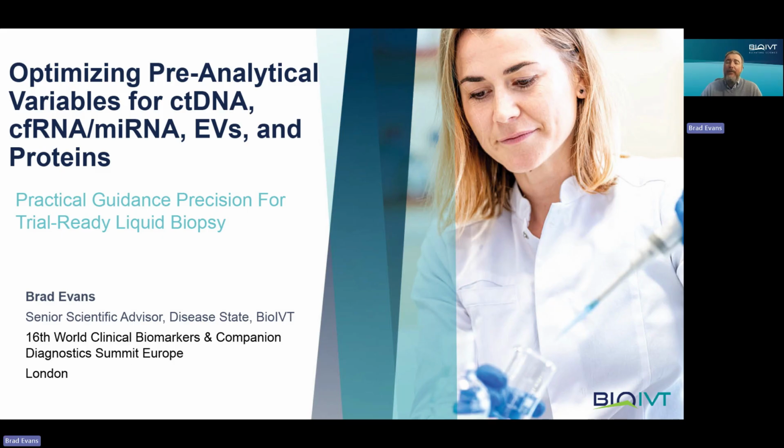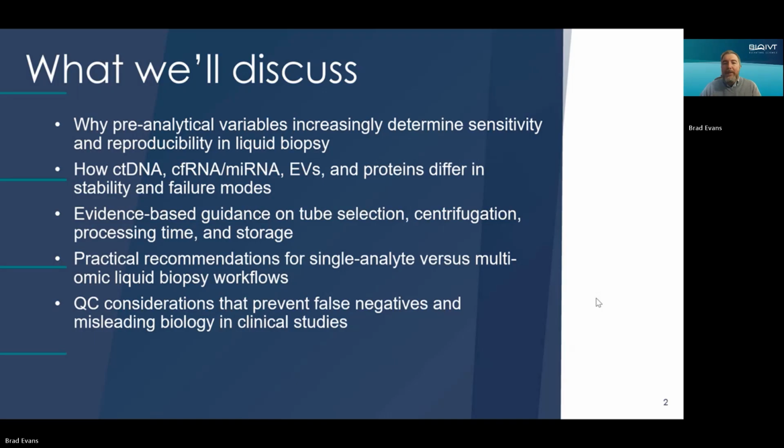So today, we're going to focus on what happens before the sample ever reaches an analyzer, because increasingly that is where a signal is either preserved or permanently lost. And once it is lost, no downstream technology can bring it back. Let's start with why this has become such a critical issue right now.